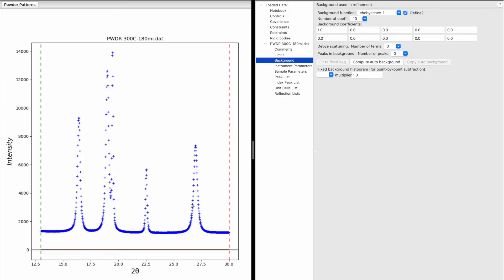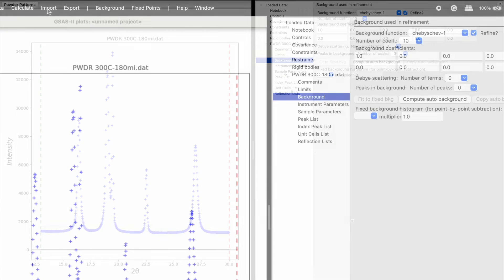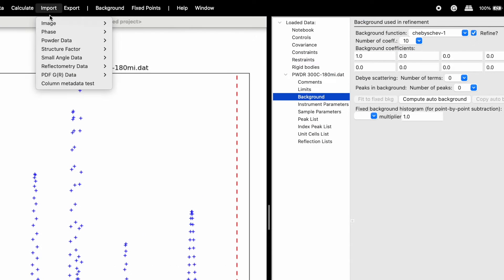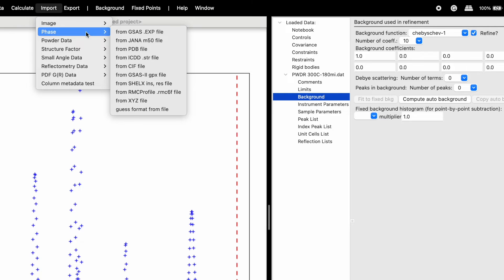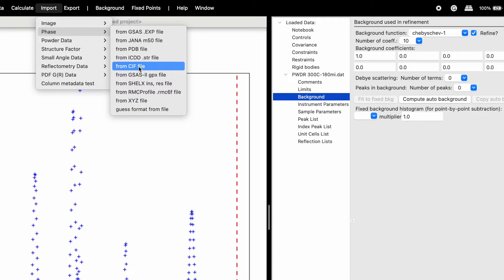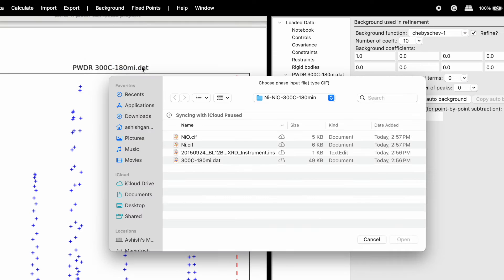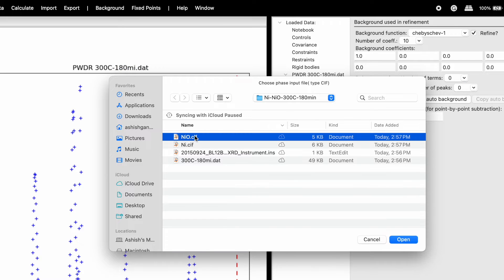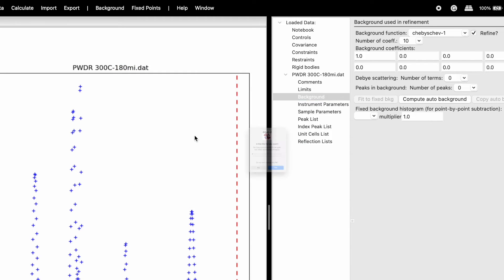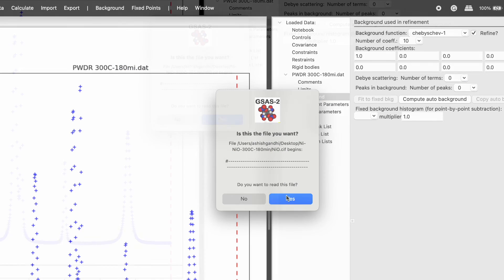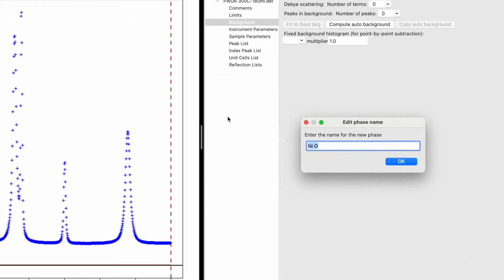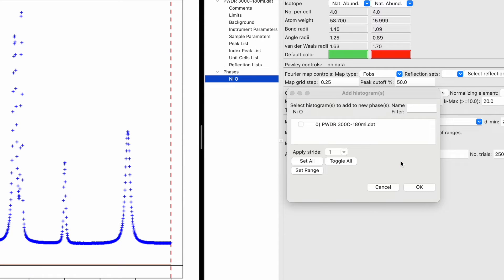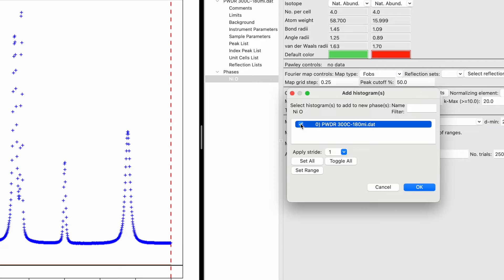Click on Import, then Phase. Choose from CIF file and import the nickel oxide CIF file. Edit the phase name to Nickel Oxide and select the histogram for which to perform the refinement.